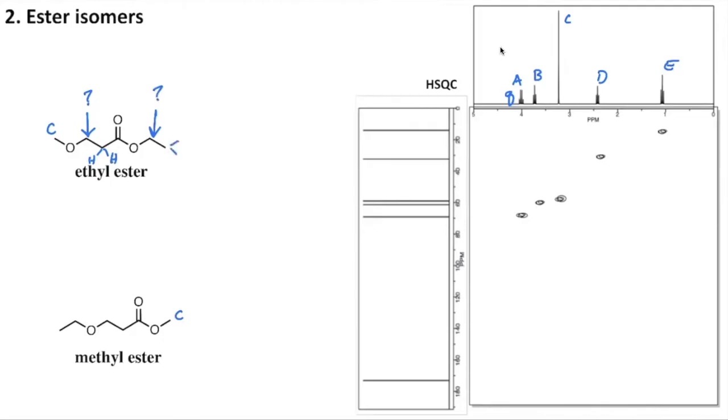That makes more sense. Now we have 3 neighbors, so this set of protons here would be split into a quartet. So let's get rid of these other ones. It must be that group there at the ethyl group end of our molecule. So again, remove those annotations and we'll label that as A.